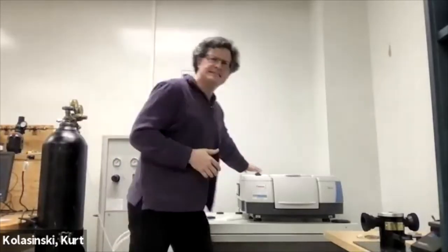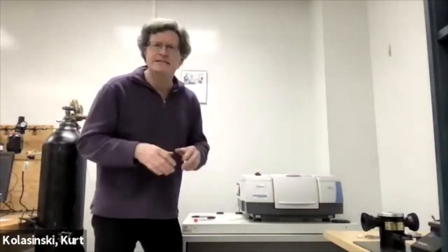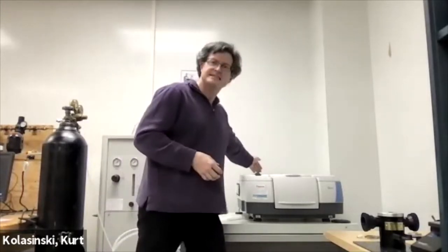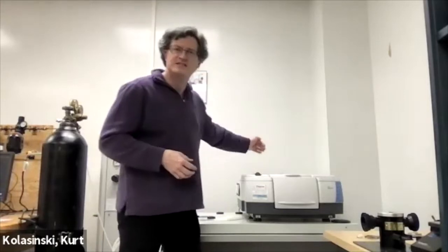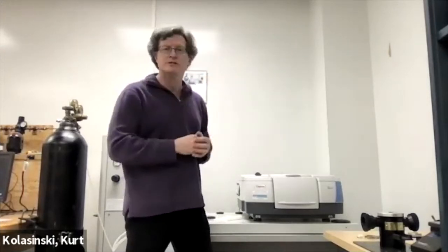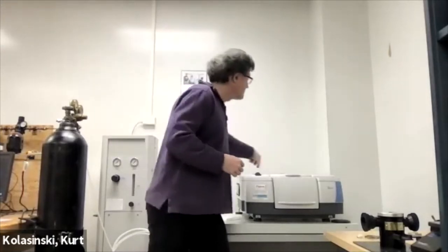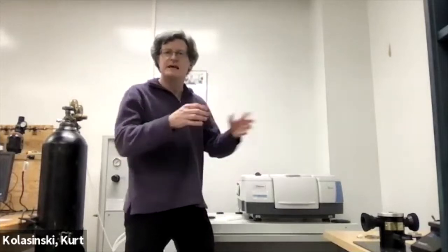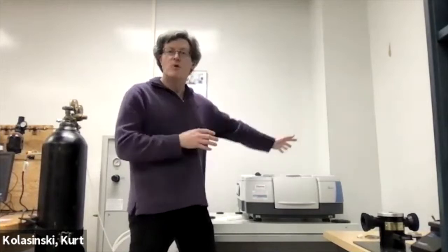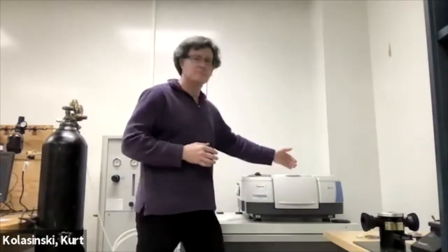Now, inside the spectrometer, this is FTIR, Fourier transform IR. What does it do? There is a glow bar. That's the source. It really is just a hot piece of metal, and it's glowing out the infrared spectrum. That should be a nice, smooth spectrum of light. And then it's got to bounce off a bunch of optics, lenses, some mirrors, right? Focusing optics, whatnot, to get it on the right path through here.